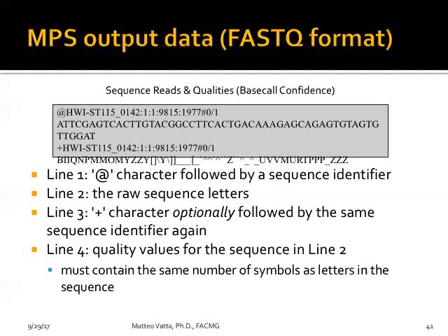There could be a lot of implementation in bioinformatic algorithms to go much faster. And if you know exactly what you're looking for, then even the sequencing technology can be as fast as real-time PCR, and definitely sometimes more accurate.